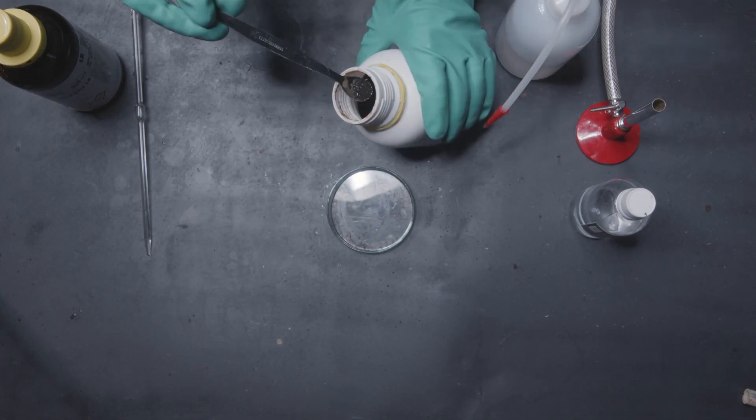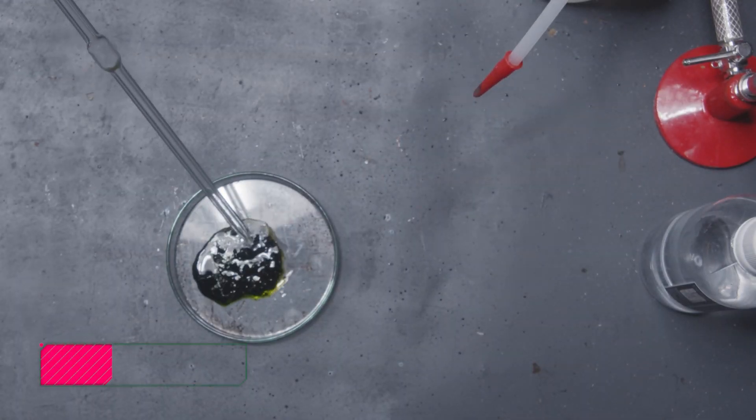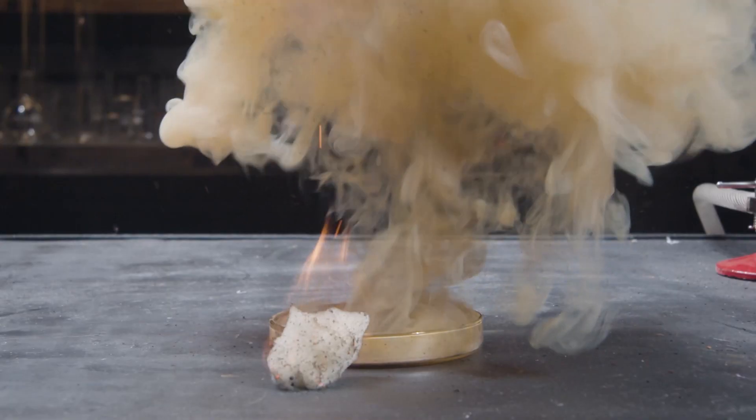Now let's burn some more stuff. Repeat the same steps as above to get manganese heptoxide in the petri dish. Now drop a cotton ball on it and witness cotton candy from hell.